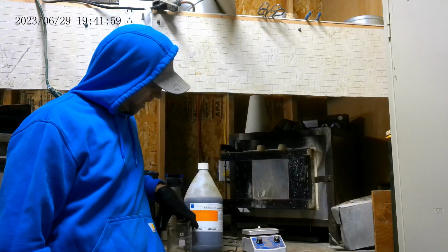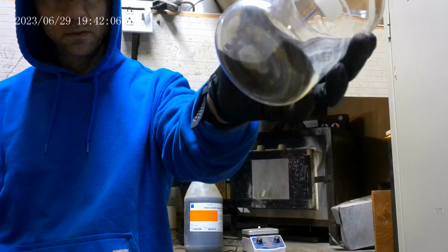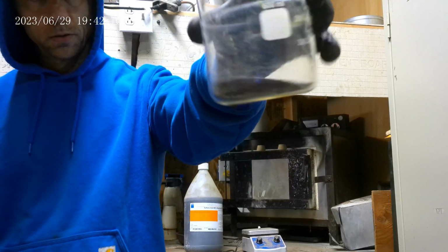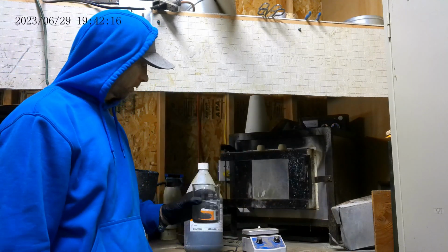Okay, I've got number 1 concentrates roasted down. Seems like a dark reddish color. A lot of iron oxide in there. Got 34.7 grams of roasted number 1 concentrates.